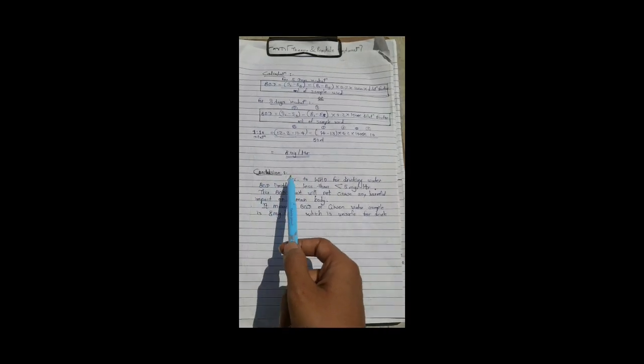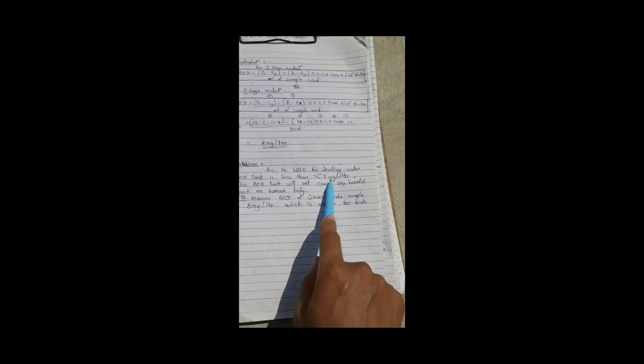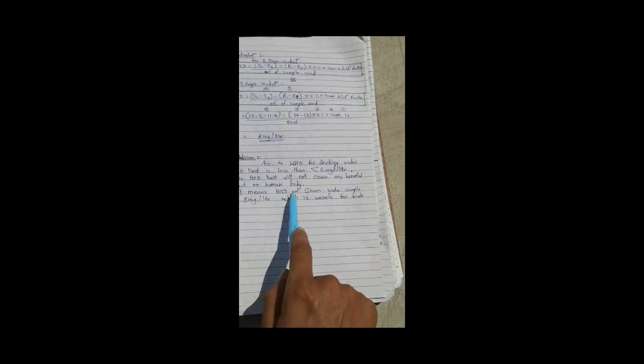In conclusion, according to the World Health Organization, the BOD limit for drinking water is less than 5 milligram per liter, and the COD limit is also 5 milligram per liter. This BOD limit will not cause any harmful impact on the human body. It means the BOD of the given water sample, 8 milligram per liter, is unsafe for drinking, and it can cause disease or is harmful to drink.